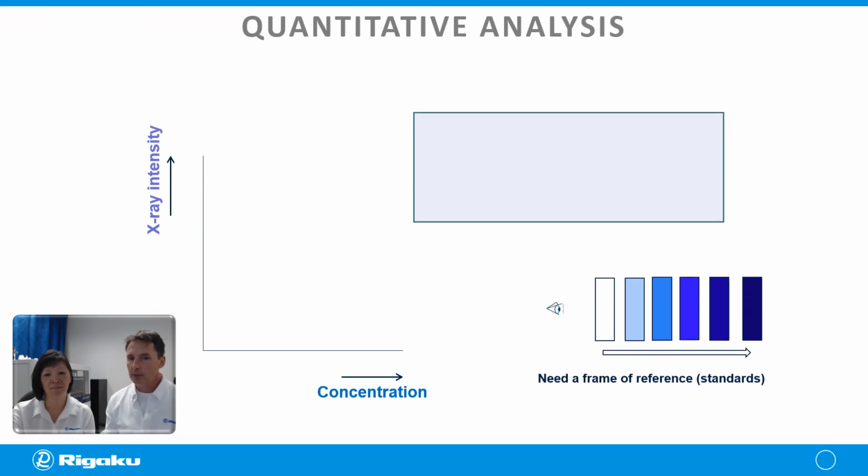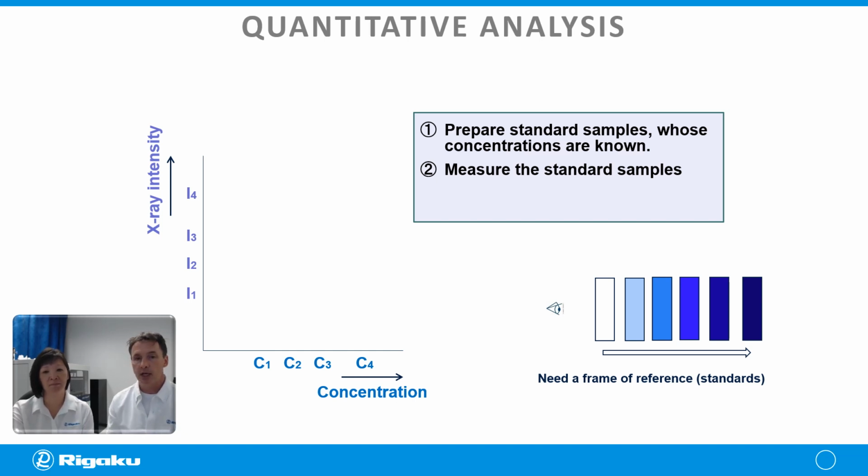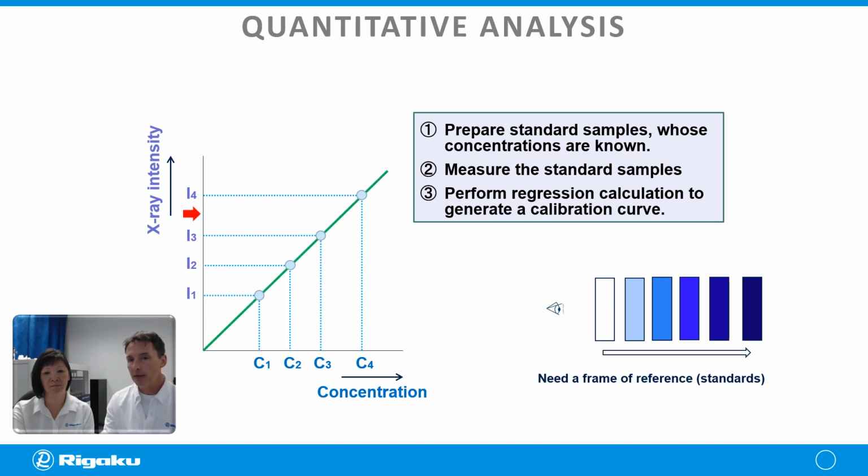So, like we said in the beginning, to do a calibration, we just need a set of standards. In a lot of cases, what we do is we just spike standards. We use ICP standards if we're doing metal analyses. You might put in different amounts of API. However those standards are made, we get a set of calibrants. We then generate intensities of the X-rays of those calibrants, and then we get a linear regression. It's actually very simple. Once we do that, we can run unknowns, interpolate, and get a result.